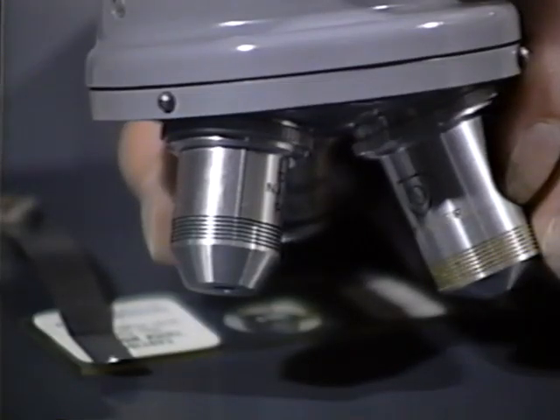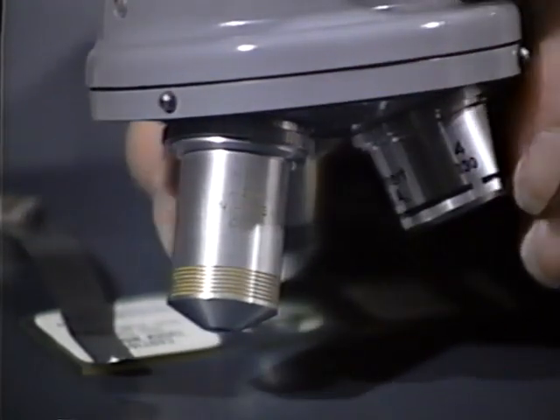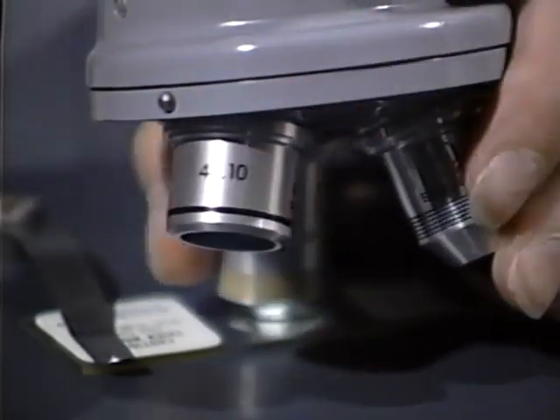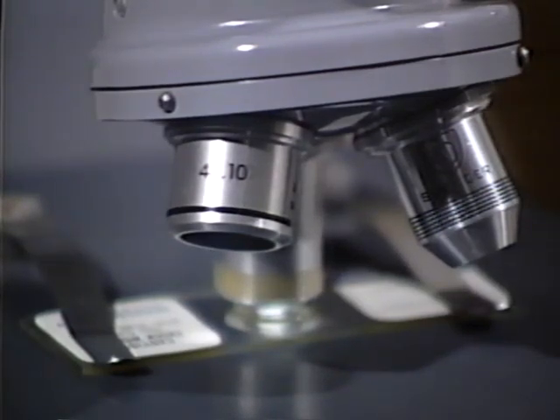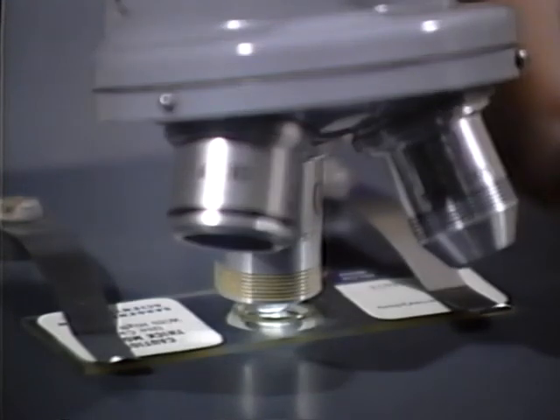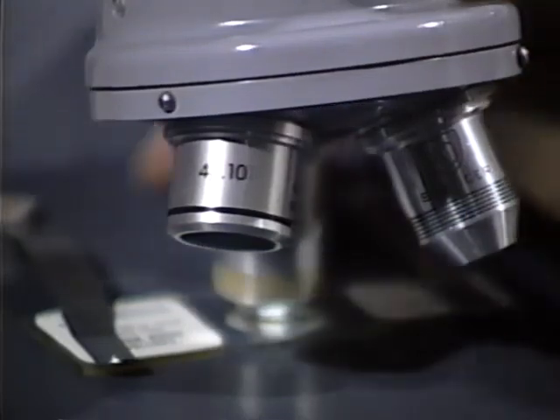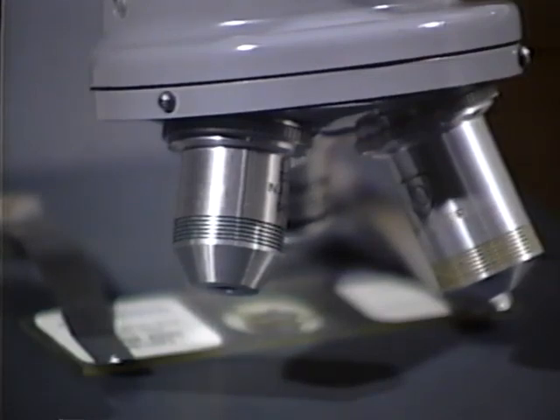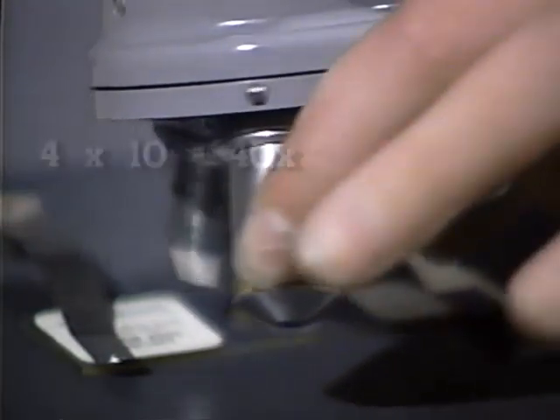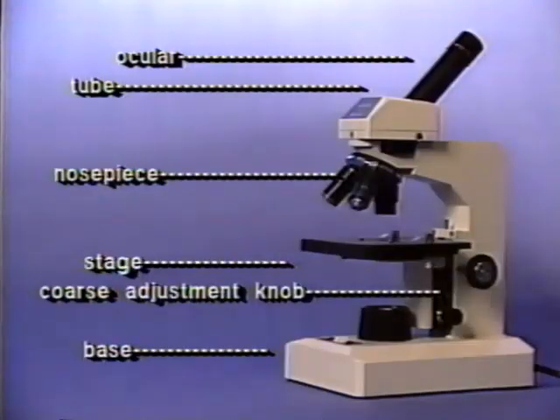On the nosepiece of a standard compound microscope are three objective lenses. Their powers are usually 4 times, 10 times, and 40 times. The eyepiece or ocular lens usually has a power of 10. Therefore, the resulting magnifications are 40 times, 100 times, and 400 times. Magnifying power is calculated by multiplying the power of the objective lens by the power of the eyepiece. Here is a compound microscope with all its important parts labeled.